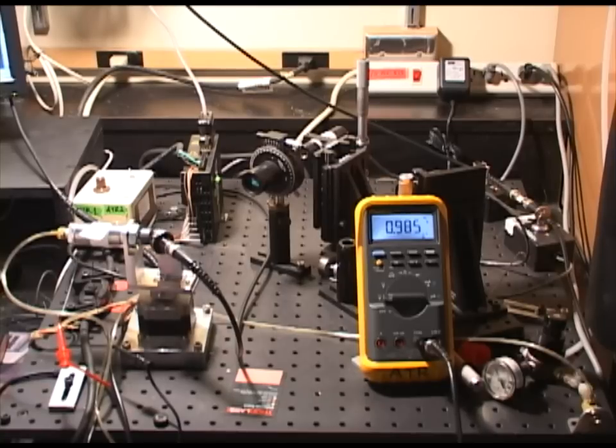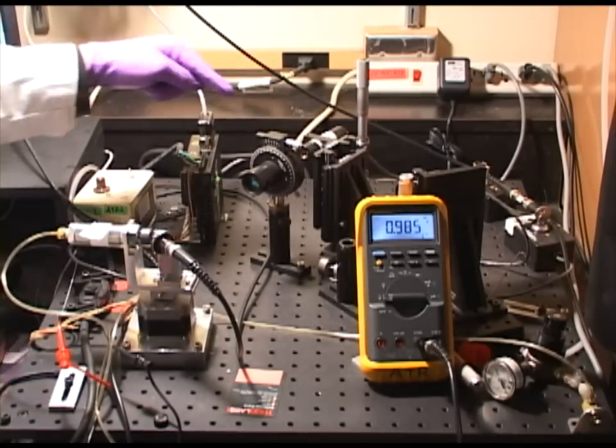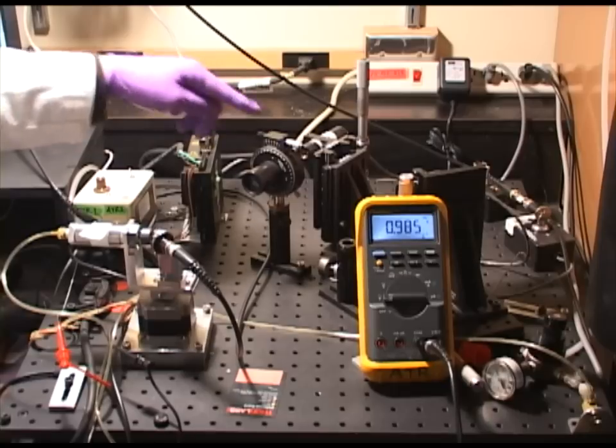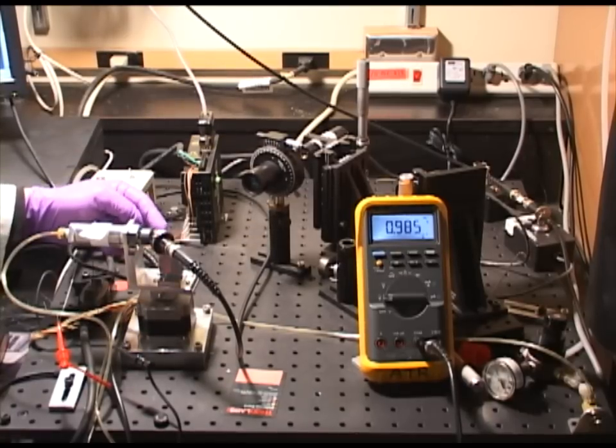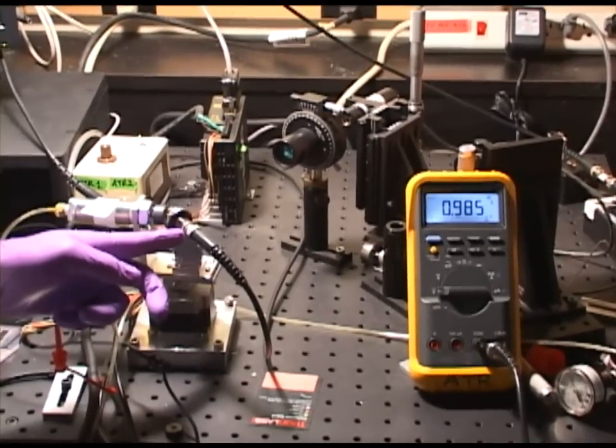First, I'll go over the device setup. It begins with the 1310 nanometer laser, passes through a polarizer, into a prism, is incident on the sample, and then passes into the detector.